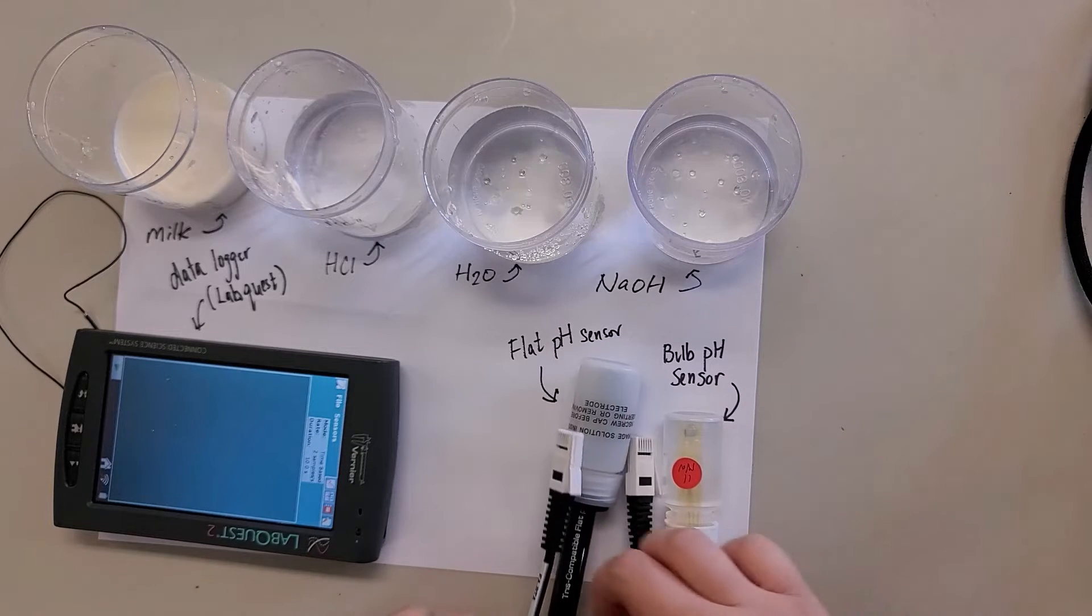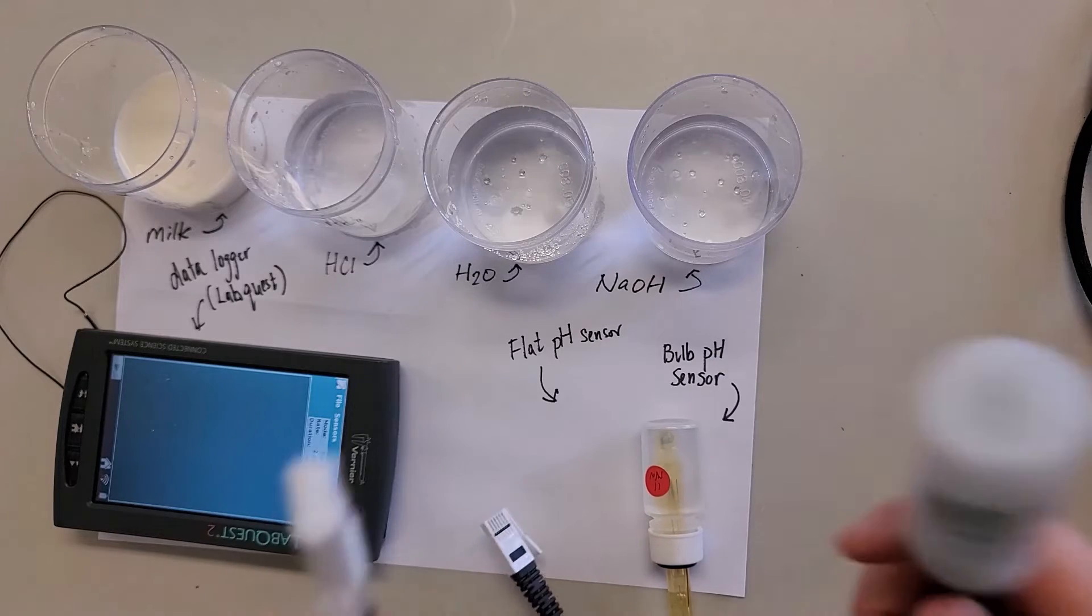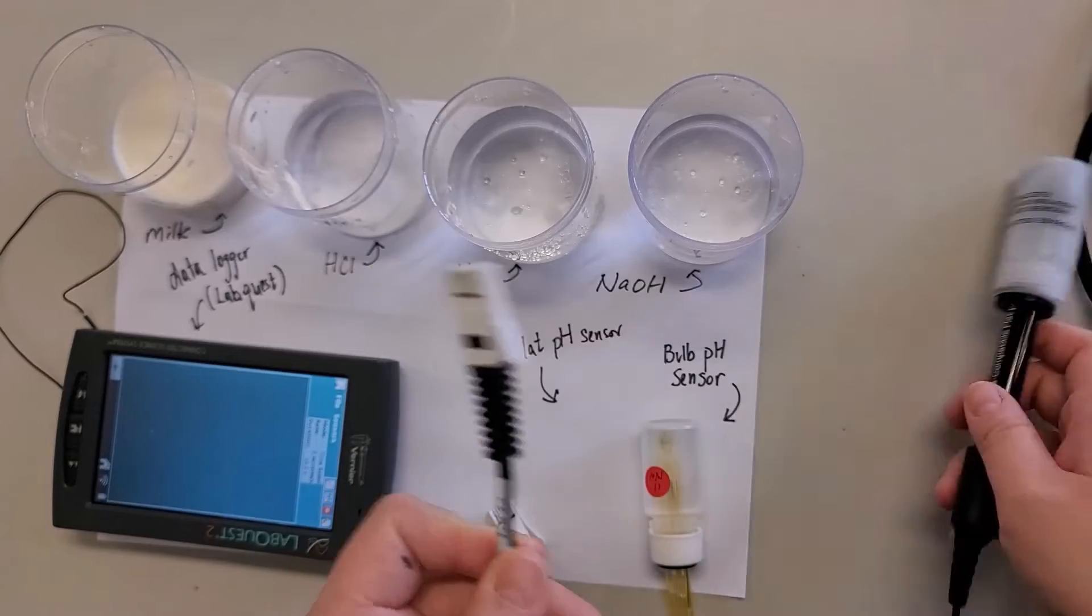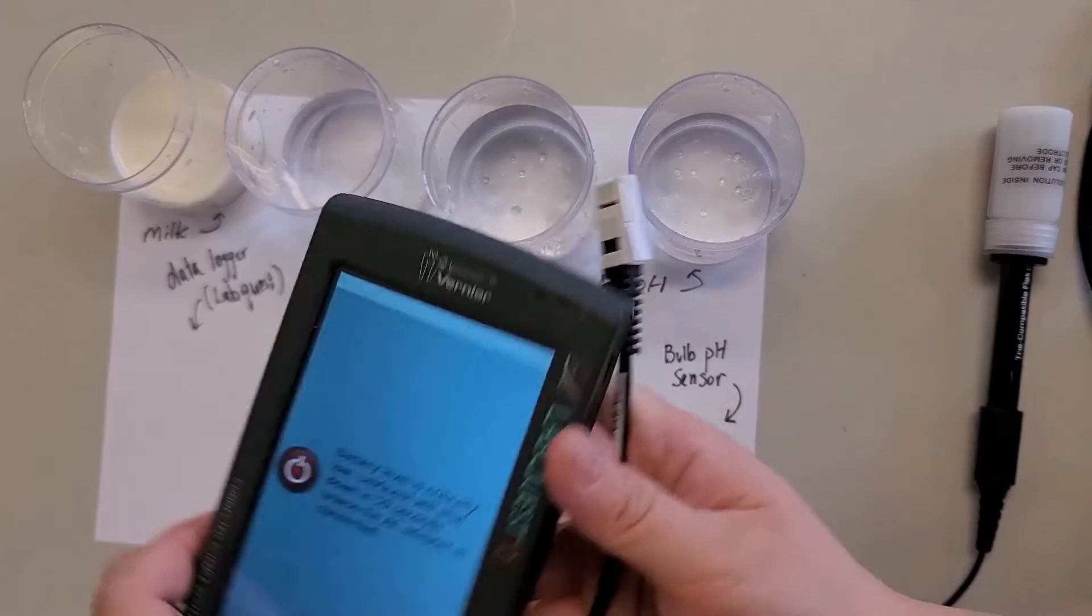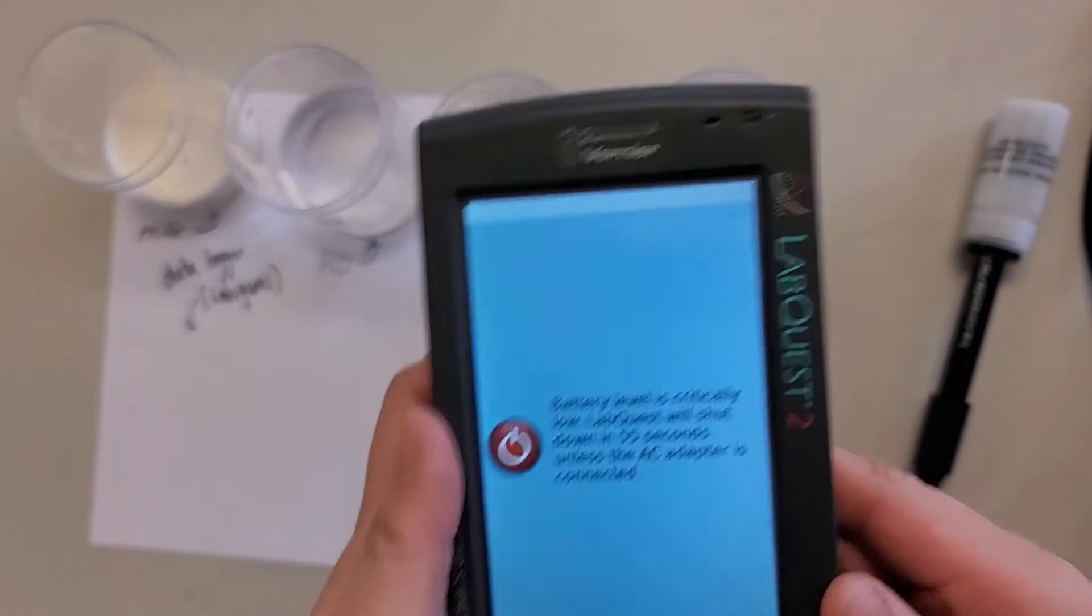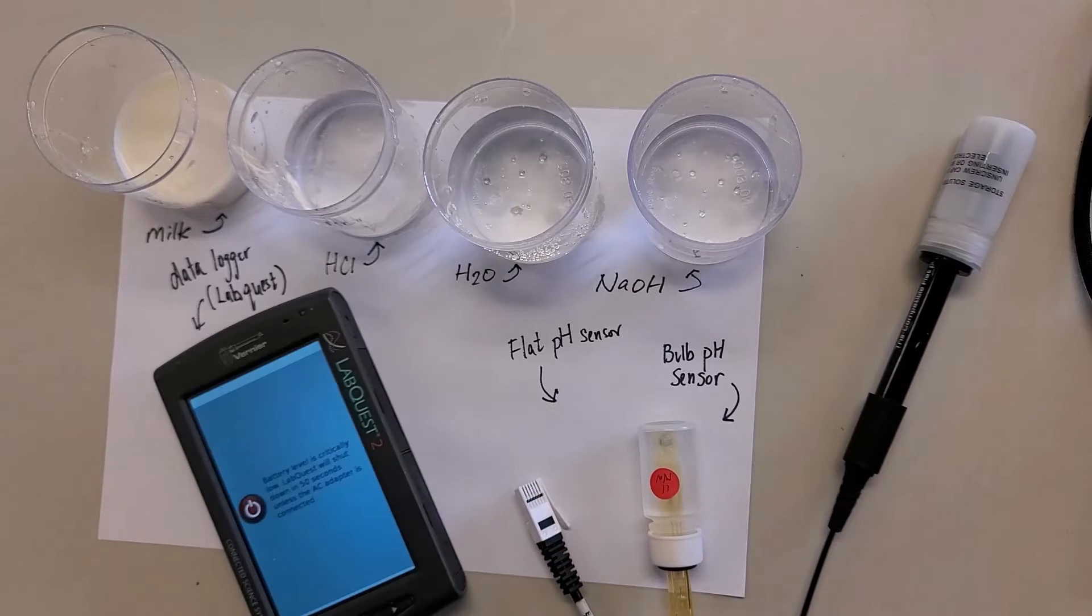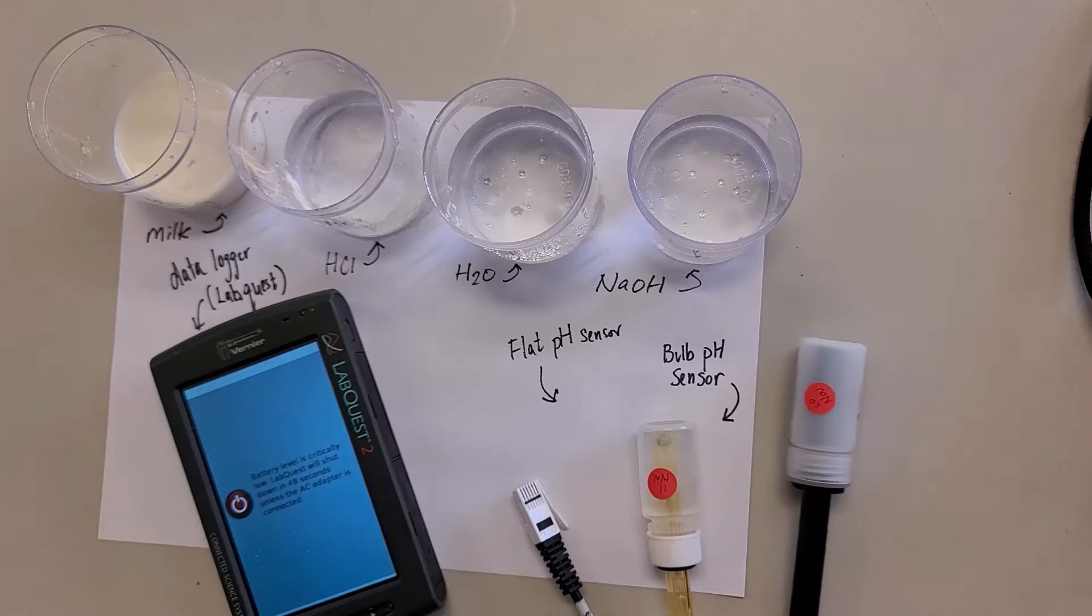So let's get started. Let's try the milk one first. Turn on the sensor. Oh, battery low. So I need to make sure again - make sure you charge it when you use it or after you finish using it, so then the next person doesn't have to charge it.